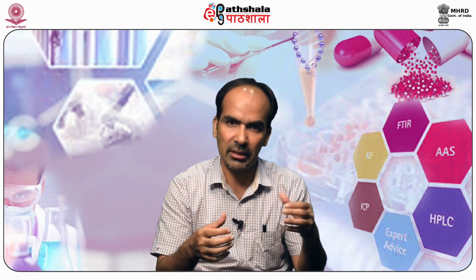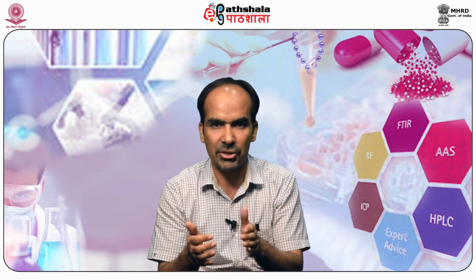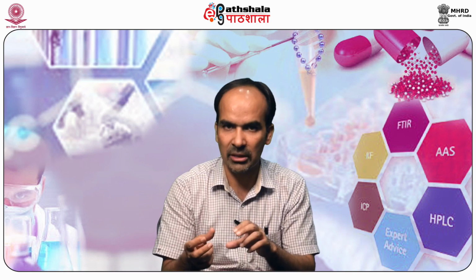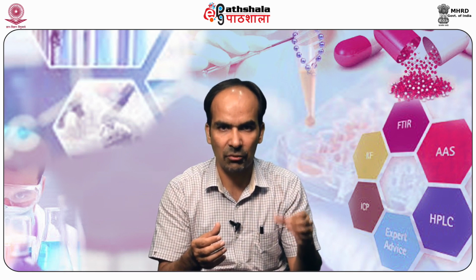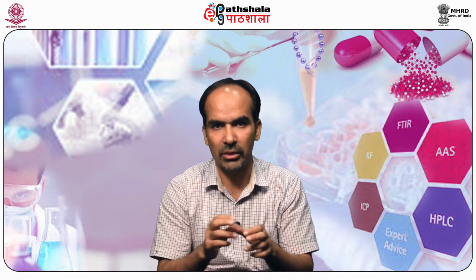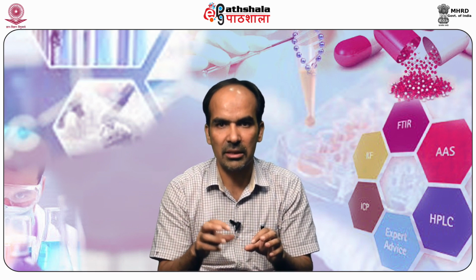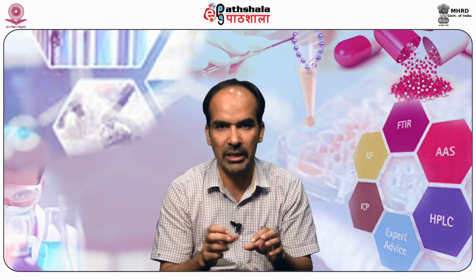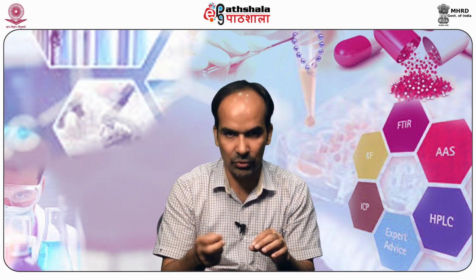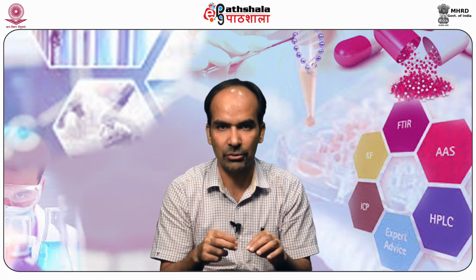So that is why the current focus is on using spectroscopic methods in conjunction with chromatographic methods. So it is being increasingly used in the analysis of natural products. So first we separate these compounds from the matrix using chromatographic methods, and then we study them by spectroscopic means. Absorption spectra such as UV and IR are very useful techniques for the spectroscopic analysis. They are otherwise also used in the identification and determination of structure, purity, and analysis of compounds.